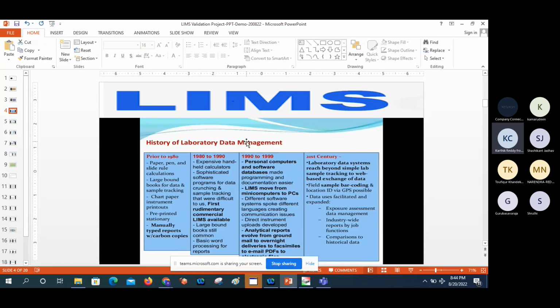After 2000, a large change in scenarios occurred. Many vendors came into the industry and market, coming forth with compliance as per the expectations of the regulatory agencies.